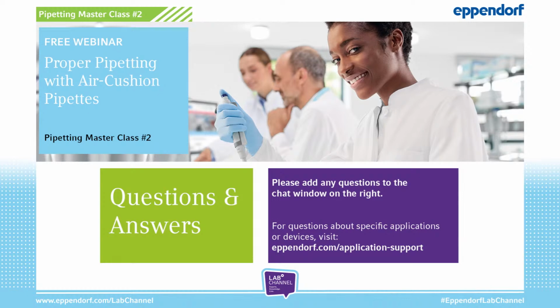Okay, so in general, you can say that the lifetime is as long as you keep the pipette maintained. Manufacturers of pipettes provide a certain guarantee period, but it is not meant as an end date. So there's no official end date. It's very important to maintain your pipettes and to clean them, especially when you're working with aggressive chemicals.